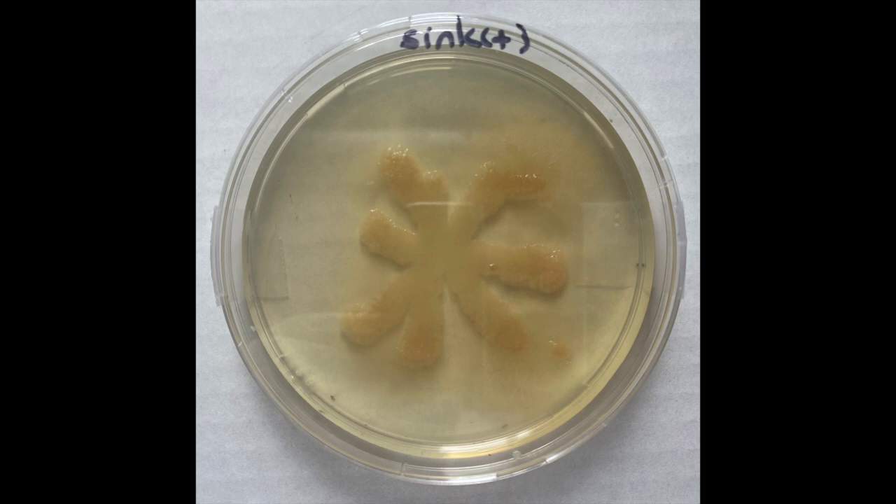This is just disgusting. You can see multiple types of bacteria, as evidenced by the multiple colors and different textures. You can also see mold forming at the edges — you know it's mold because it has that fuzzy appearance to it.